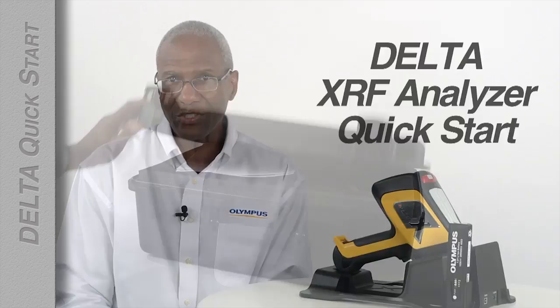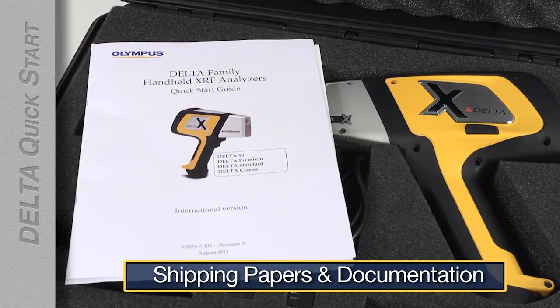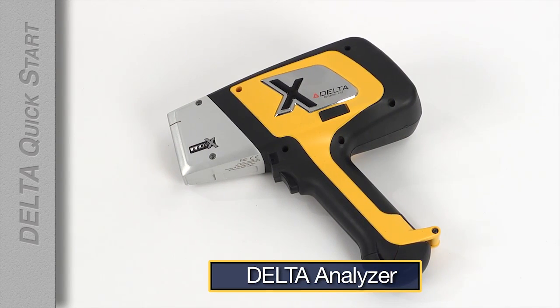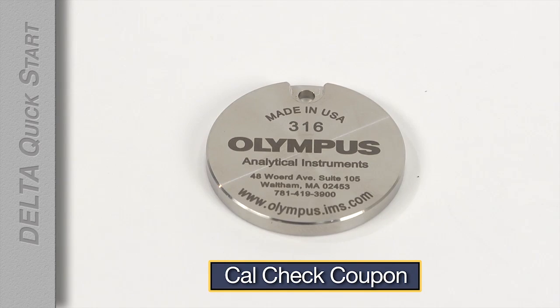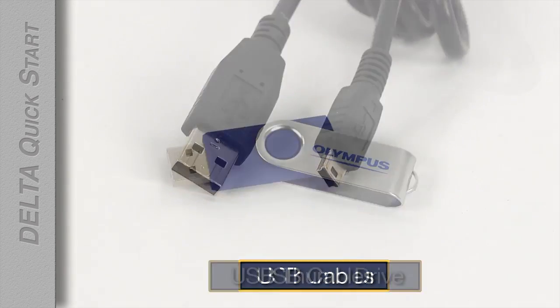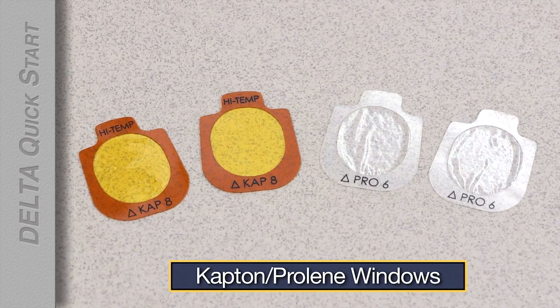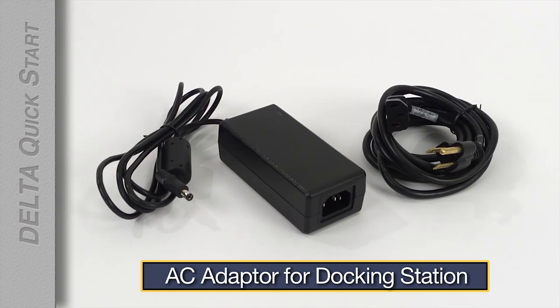When you first open the case you'll find the shipping papers and documentation for your Delta analyzer, two lithium-ion batteries, the CalCheck coupon, USB cables, a USB drive that includes software and user documentation, either Kapton or ProLim windows, and the AC adapter for the docking station.